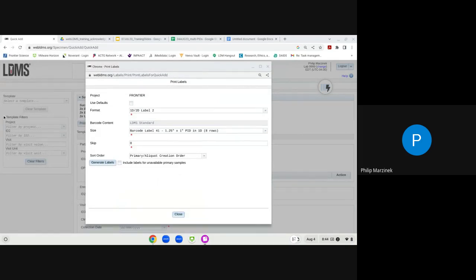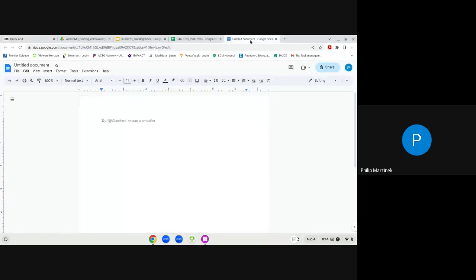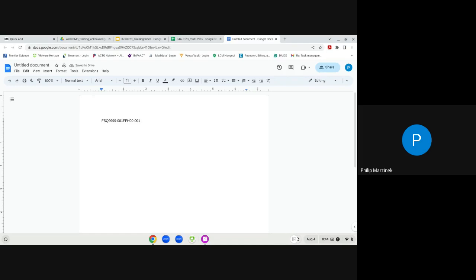Here is our labels PDF showing the 2D barcode and 1D barcode, project and participant information, collection date, global specimen ID, and primary and aliquot details. To print, do not use the print button in your browser — open the document in Adobe Acrobat or the proprietary software that came with your label printer. This ensures more robust printer settings, allowing you to adjust intensity and burn to ensure barcodes are printed at sufficient resolution to be read by a barcode scanner.